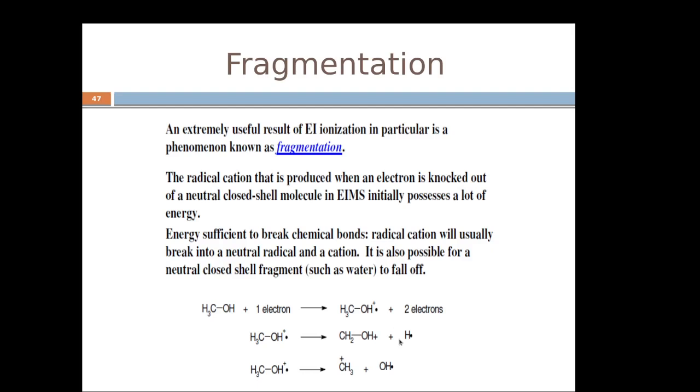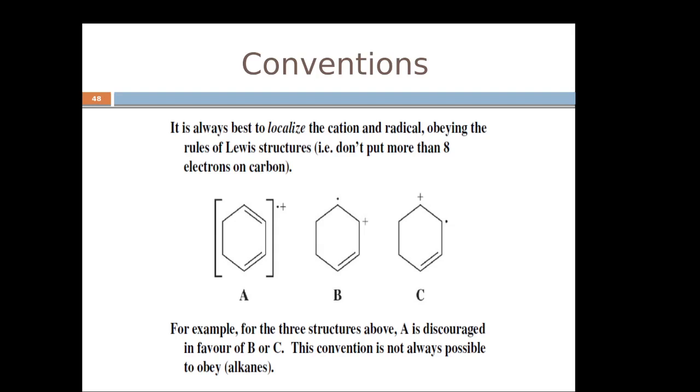How do you know what kind of fragments form, or what are the possible ways in which fragments can form? There are some general conventions which have been empirically formulated from the observations of different fragmentation patterns resulting from impact ionization on different molecules.